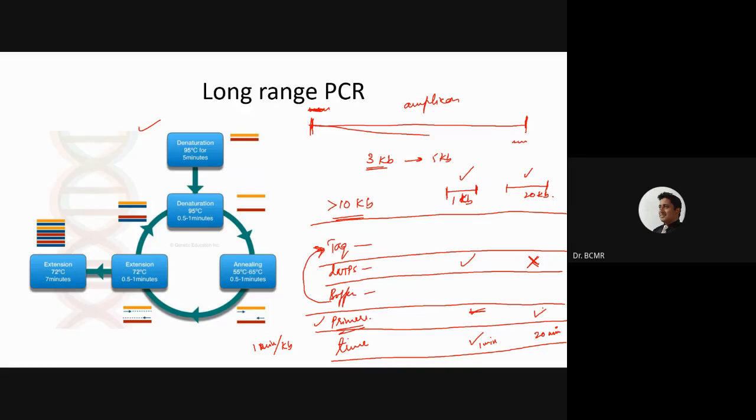It also depends on the type of DNA polymerase that we are using. For something with high fidelity, that is one of the issues. If we are going to do that, the program is going to take longer, and the time in the cycling may also influence the stability of the polymerase that we are using.